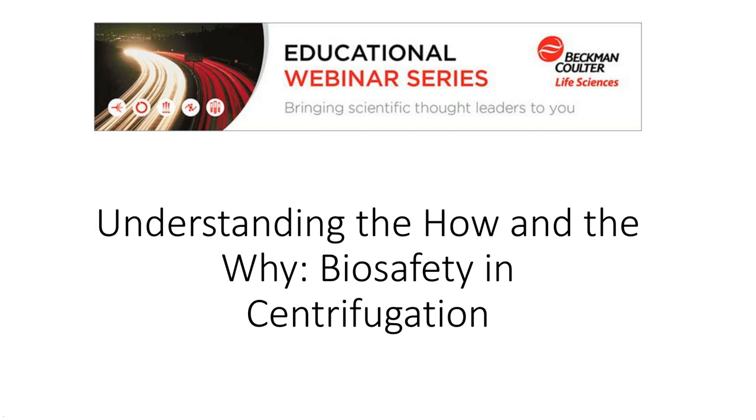So our recommendation is to watch that and to remove that salt through this rinsing process. And then at the end, after a good flush, turn the rotor upside down to let it air dry. So that's basic rotor maintenance right there. But also a good procedure on how to treat every rotor.